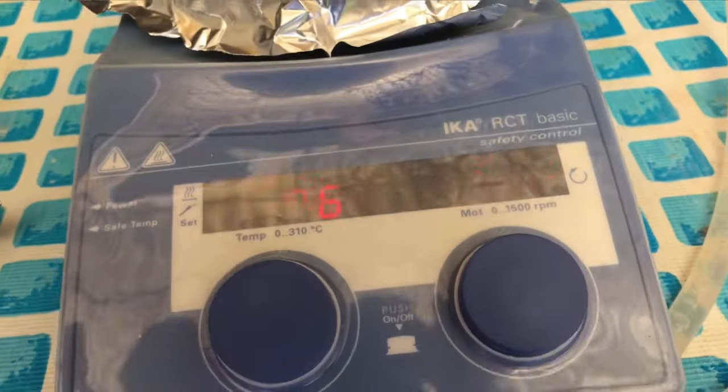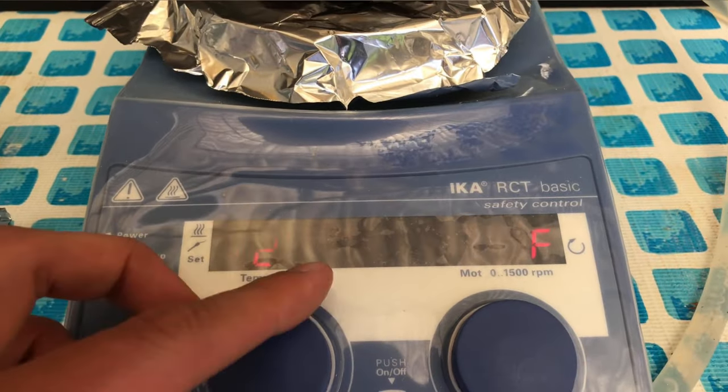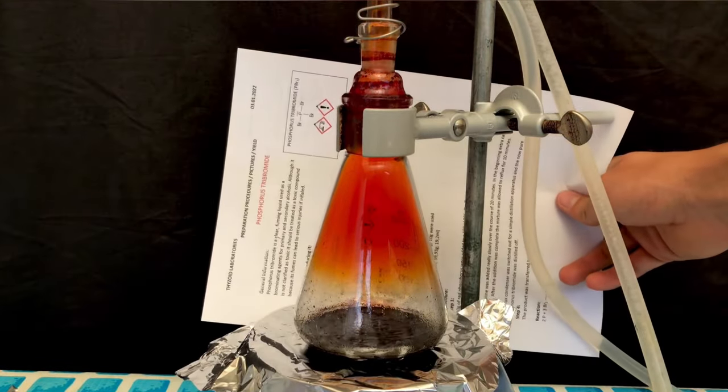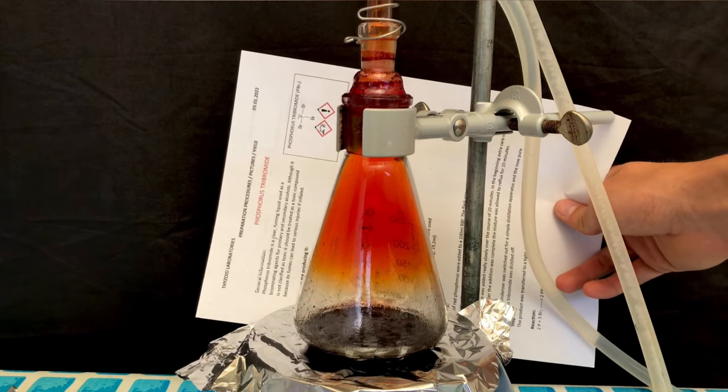To make it cool back down to room temperature even faster, all aluminum foil was removed. As you can see here, there's still bromine vapor left in the flask, but as there's also phosphorus, this doesn't matter.